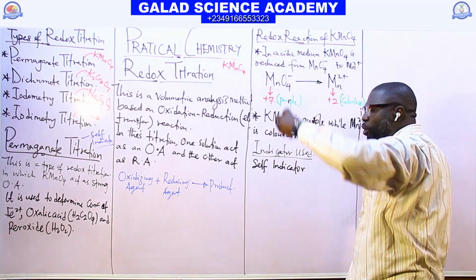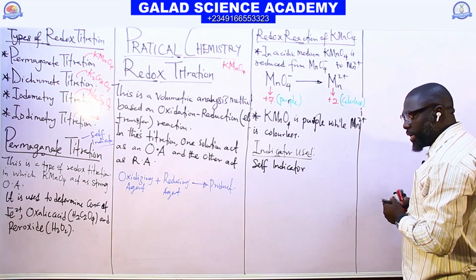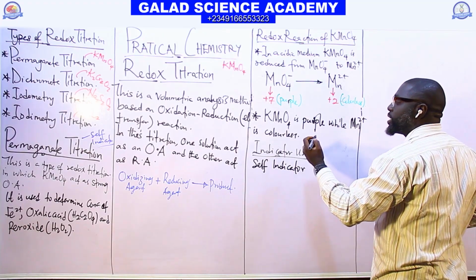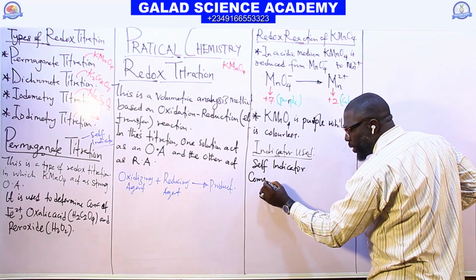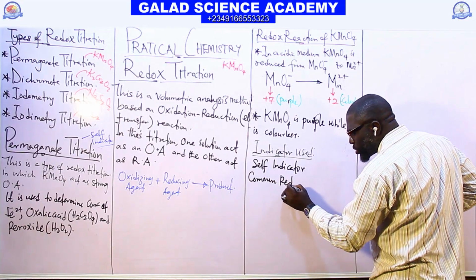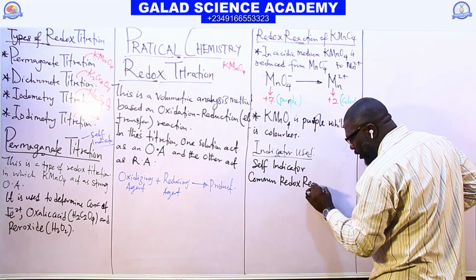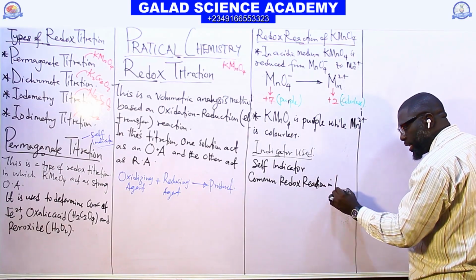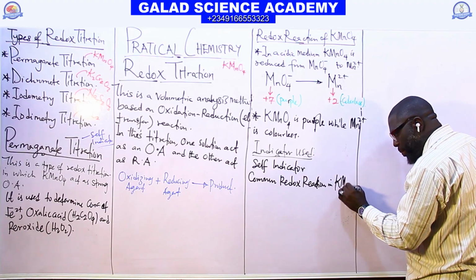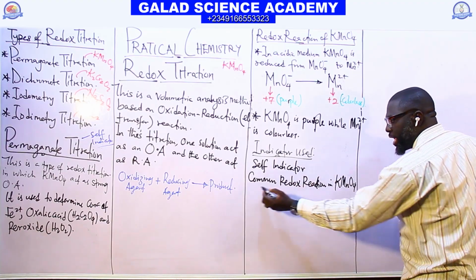And what are the common redox reactions that you can use KMnO4 for? Let me say the common redox reactions in KMnO4 titration.